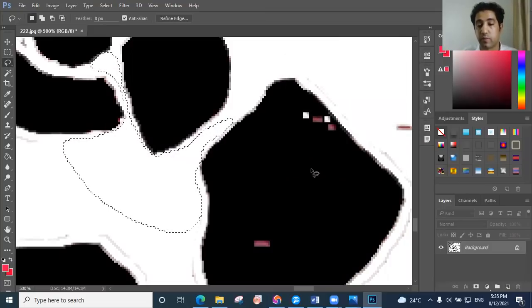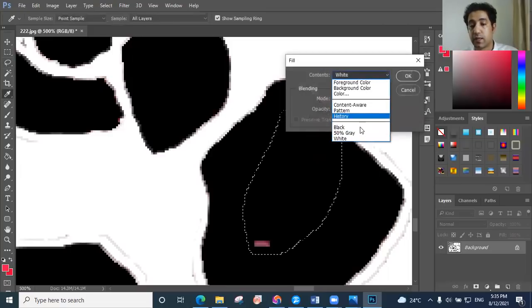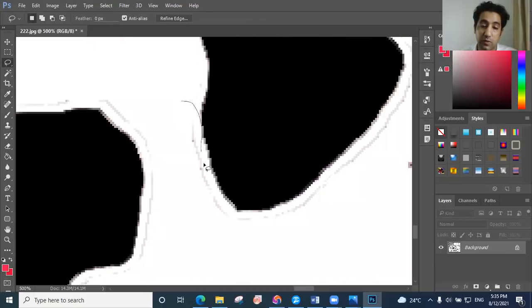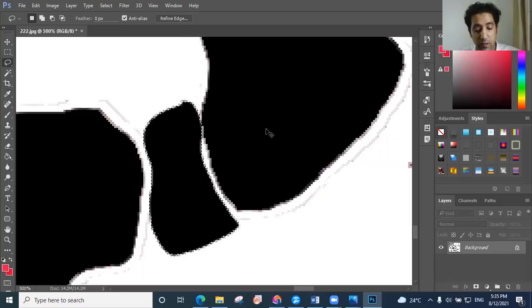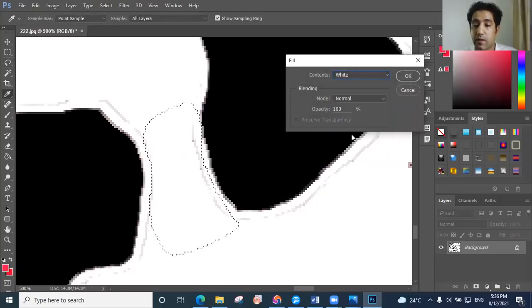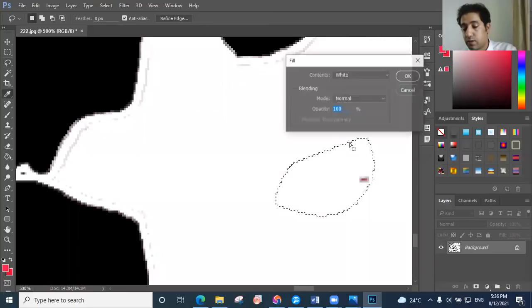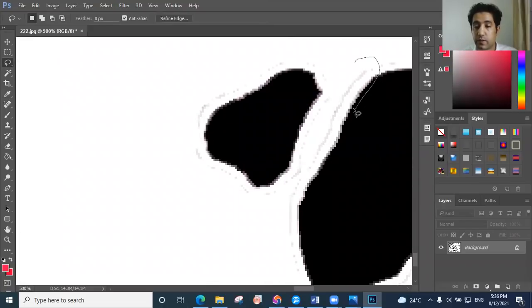So you can solve the problem by doing this, and this you just make it black, or even if you don't make it, these dots will not count as another grain, only the app will get this wrong. You can just delete back. All right, here, you made a mistake, just click again and it will disappear.